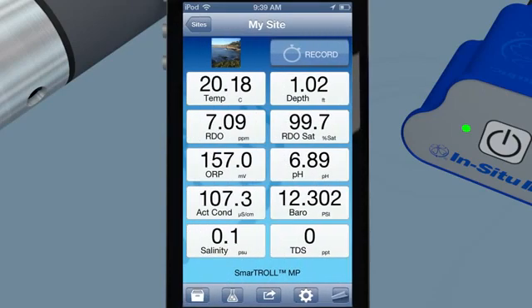Access in-app software add-ons such as low-flow sampling from the In Situ home screen. Be smart. Be mobile. Be in situ. The future is now with the new SmartTroll multi-parameter handheld.